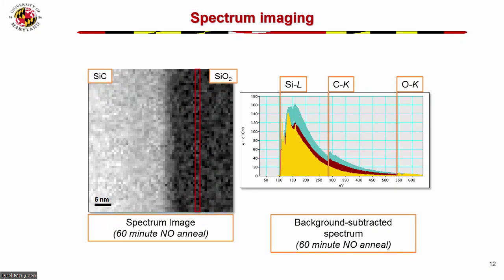So in general, a sharp increase is where the minimum transition would be, corresponding to the energy gap, basically. And then all this is transitions to higher energy levels within the conduction band. So this has a lot of information. It's just not very easy to interpret, but it's a lot of information on the conduction band.